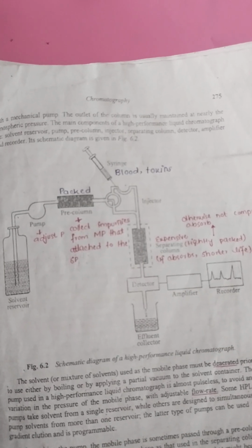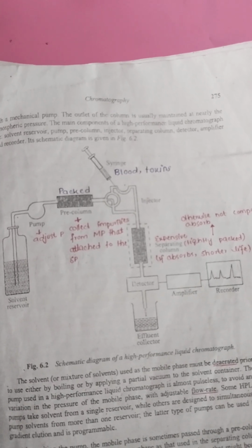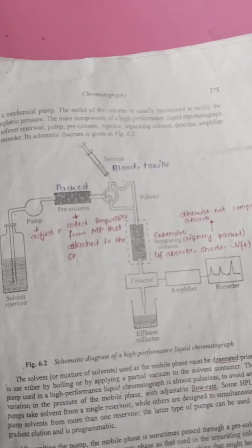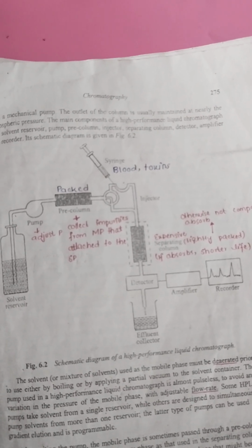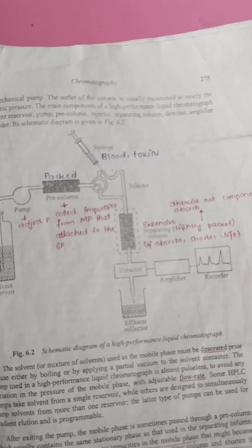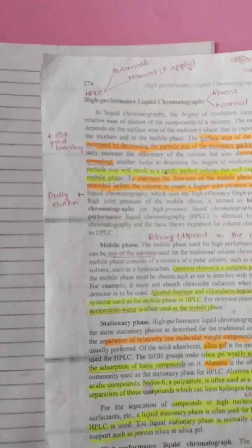Then there is the detector. It determines the separation of the column and automatically monitors the components that are separated, and sends an electrical signal to the amplifier that increases our result, and then records our result as a graph. There is an effluent collector, where the separated mixture is collected. In the next section we will discuss the detectors of high performance liquid chromatography and mass spectrometry.